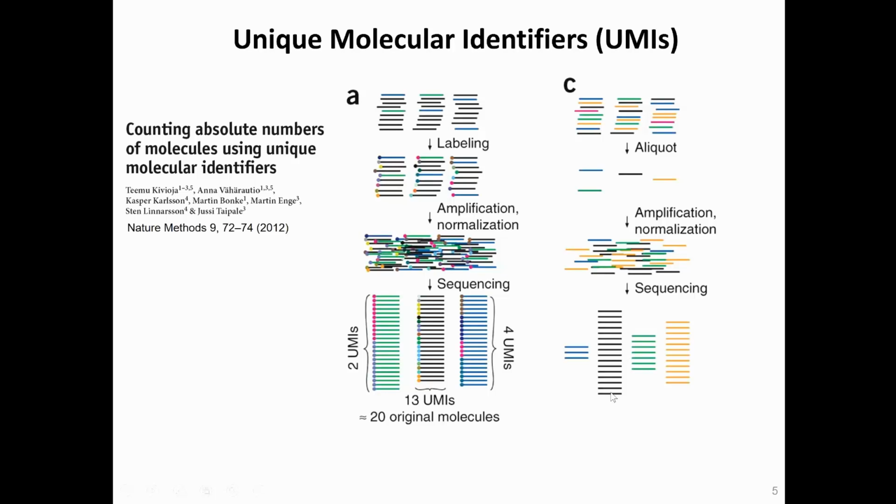And unfortunately, that's not going to be the case, especially in the amplification step. There are certain sequences which are going to be amplified more than other sequences. So one way around this is to, before you do the amplification, add a unique barcode. This is a 16 base pair sequence, 6 of them which gives information about what well the experiment is, and the other 10 is a random sequence which is attached.